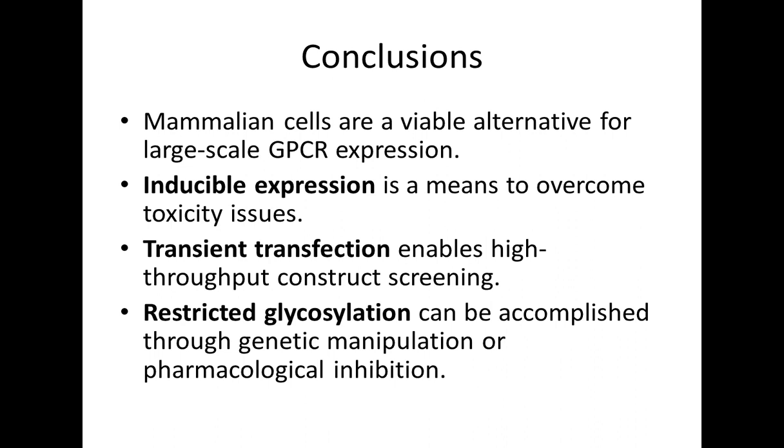Regarding these specific cells, I don't have a lot of experience with the other line that was mentioned, but it could be something as simple as each cell line having somewhat different post-translational modifications, a different complement of proteins. Even within mammalian cell lines in general, there are probably going to be a lot of very cell type specific differences.